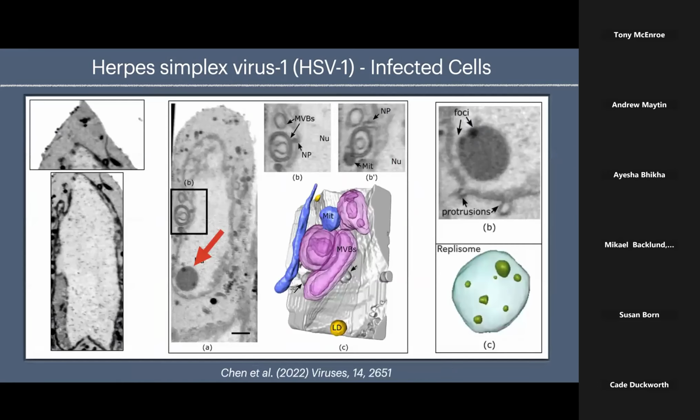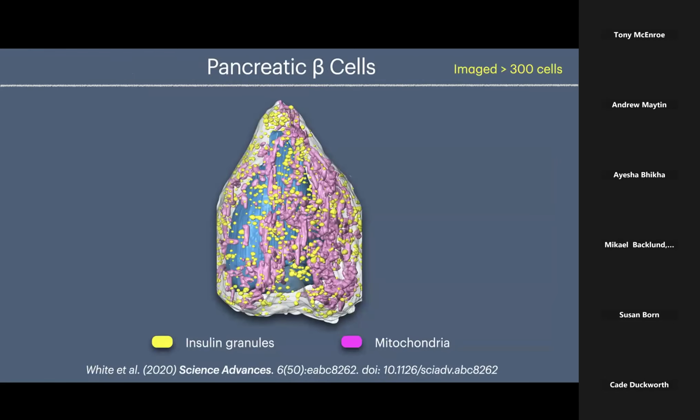Again, just looking at the formation of the structures that viruses form, these elaborate membranous structures that apparently transport the virus particles.